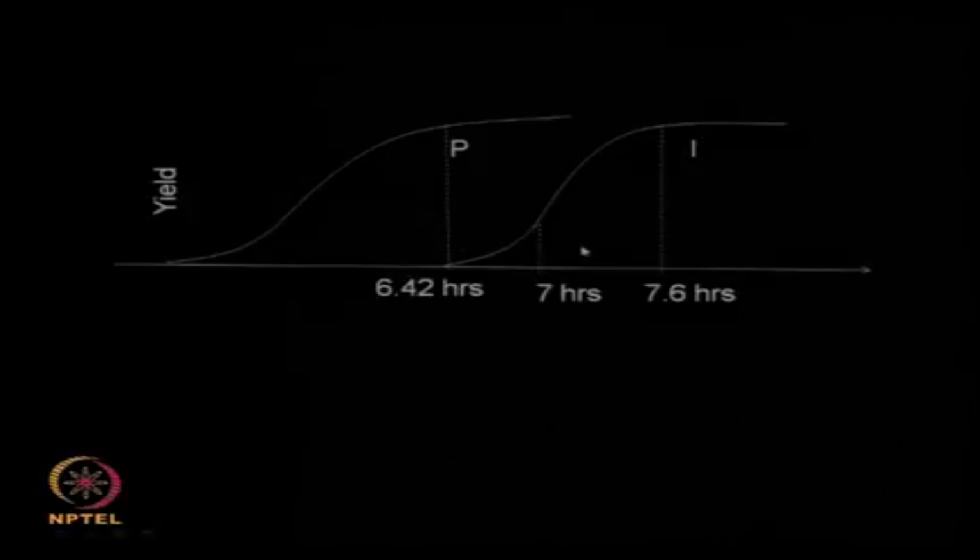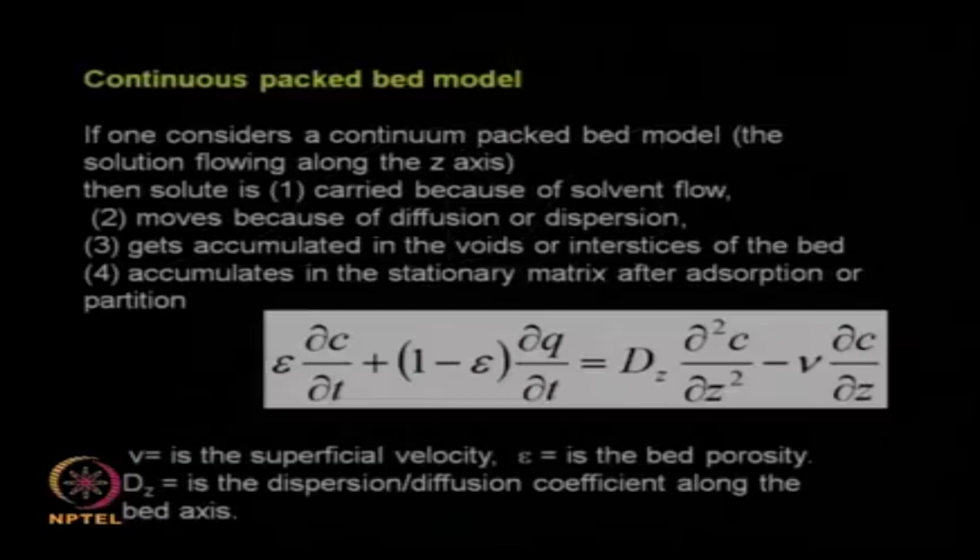So if I go further, I will be collecting some amount of impurity as well, whereas if I am here I am going to get pure protein, whereas if I travel a little bit here I am going to bring in some of the impurity also in my product. So the purity of the protein is going to go down, okay.